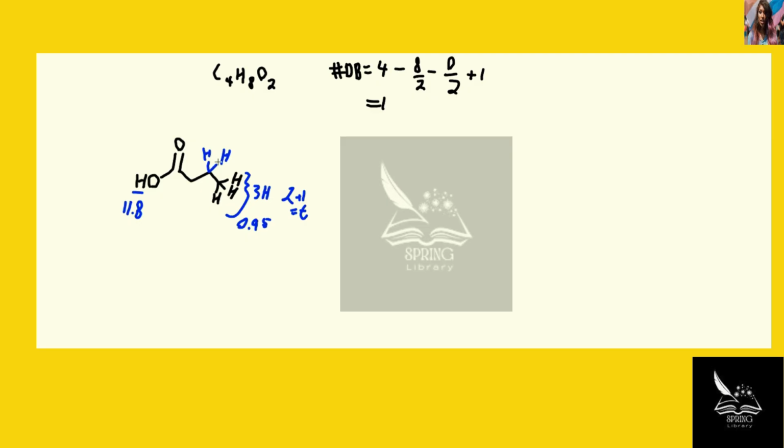So now what about these 2 protons here? Well, they're neighboring 3 protons on the right, but they're also neighboring these 2 protons on the left. So these 2 protons in blue are going to be represented by a multiplet. Remember, you have your n plus 1 times your n plus 1, so you can have 4 times 3. So you might have 12 peaks in this one, maximal.